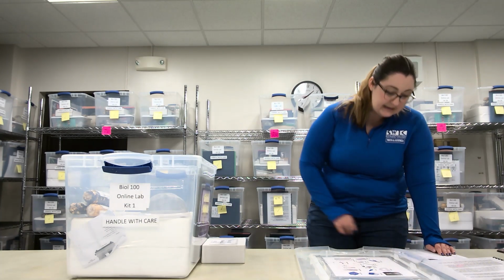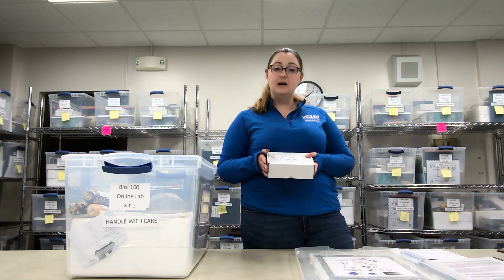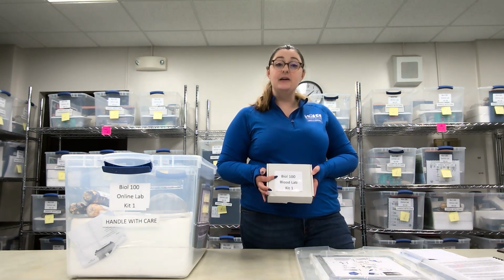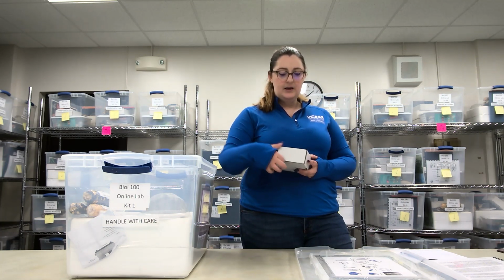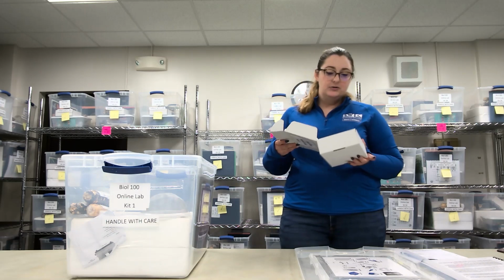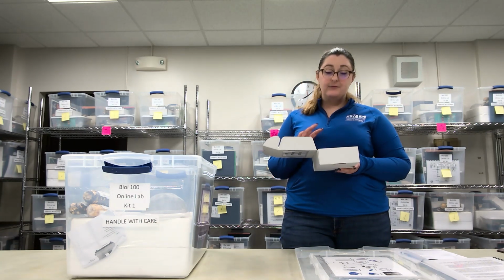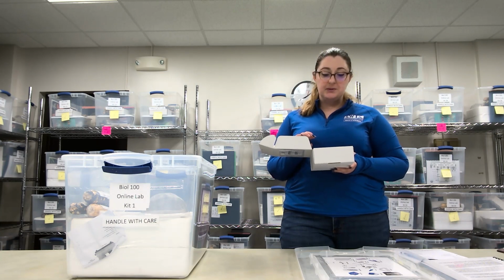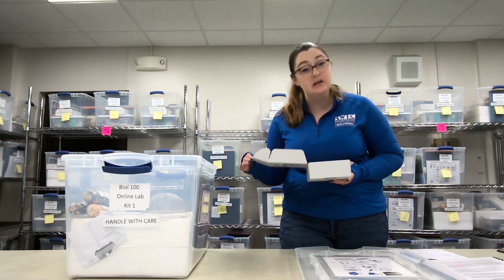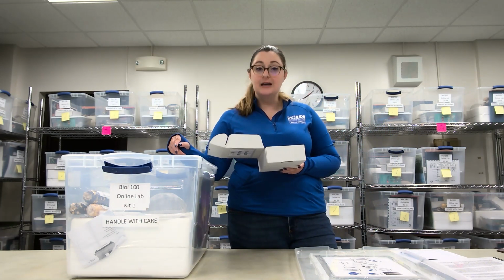From there, it is the blood lab kit. You will need to find the smaller box that says blood lab kit on it. If you open that up, you should have 7 bottles. 4 of them should be red, 1 should be blue, 1 should be yellow, and 1 should be clear. So make sure you have those 7 bottles in your blood kit.